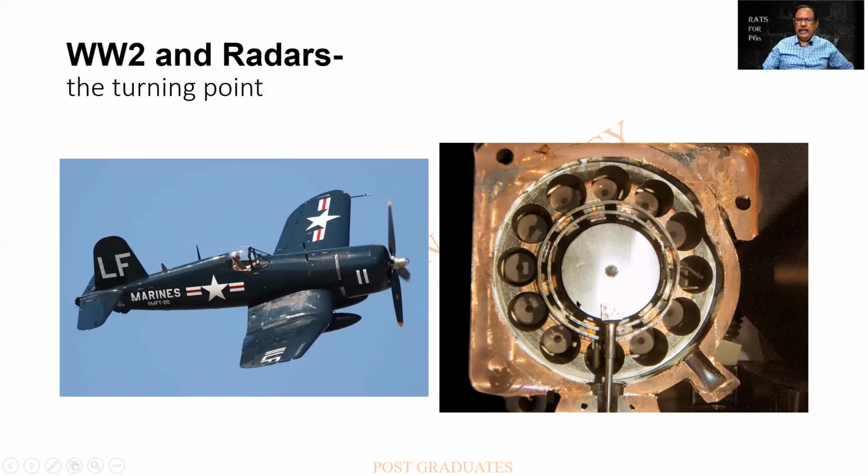As I had mentioned earlier, this is the central region wherein there is an energy that is being obtained in the cathode. There is a breakup of the molecules. Usually what happens is they are confined within a circle, but here provision has been made for extensions of these. I will be showing this in the next diagram also. So you find that there are pockets of extension and it goes within.